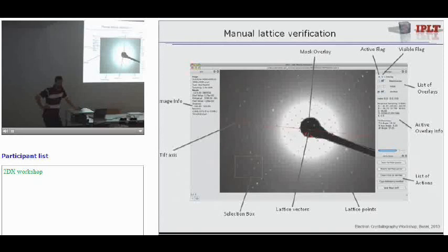As I remember, one of the programs was something called reindex, which tries out all the various reindexing: it takes the index you've done, redoes it according to a certain range of possibilities, and compares them to the existing 3D matrix of lattice lines, and finds the one that's best.